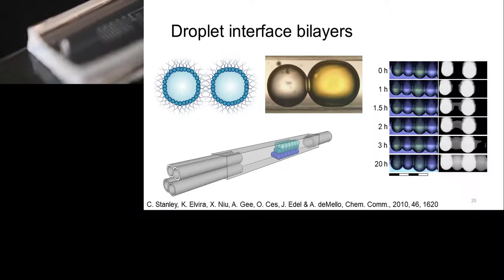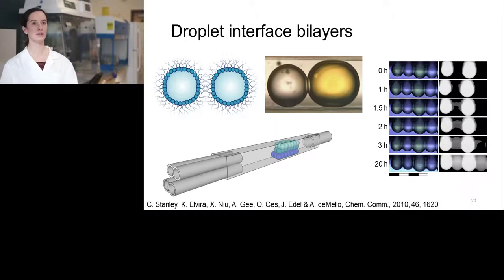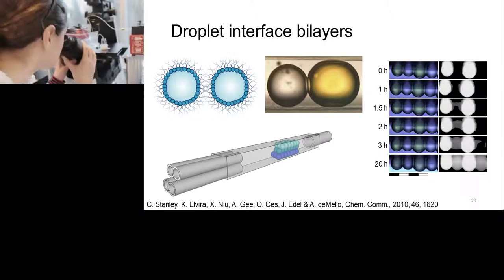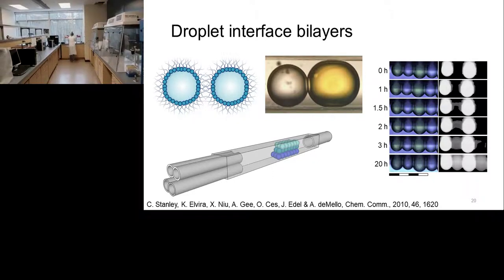In the same way, now you're in a chemistry lab and you would probably use some glassware to pour some liquids together to do a reaction, but it's big volumes of liquid, and now we can do that on a chip with tiny amounts of liquids. So at the moment, they're very simple artificial cells, but the idea is that as we get better at building them, and we do more research in this area, we can make them really similar, at least to the cell membrane, to the cell skin of normal cells.